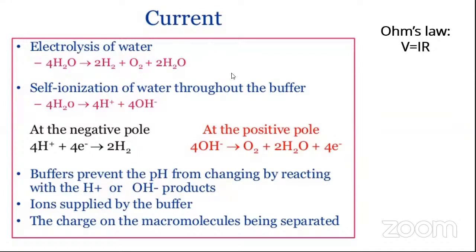Whenever a molecule of your interest is moving under the effect of the electric field to its oppositely charged electrode, it is not going to pass other molecules just like that, right? There will be some degree of friction happening. And this frictional component is pretty important here, because that will be causing the extent of resistance.